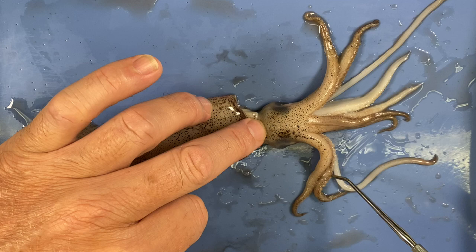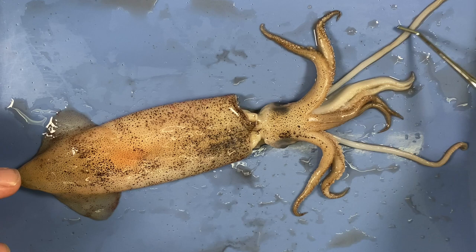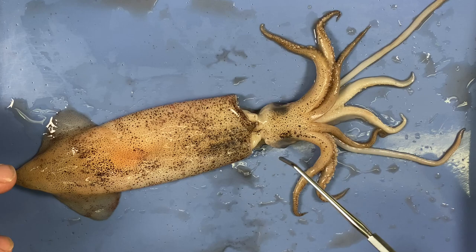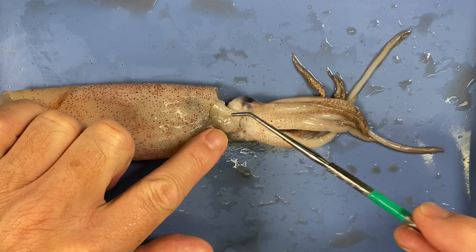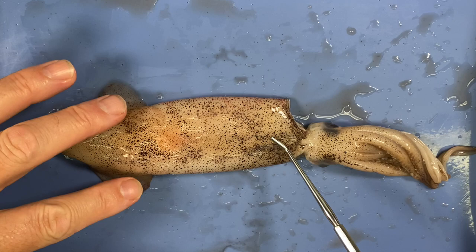If you count them you'll see we've got one, two, three, four, five, six, seven, eight arms — all lined with suckers and all about the same length. Then we've got these two long tentacles, and at the end of the tentacles there are also suckers. I'm going to flip it over and show you this structure here — the siphon. The siphon, head, arms, and tentacles are all a modified muscular foot. Inside the mantle cavity is all the visceral mass.